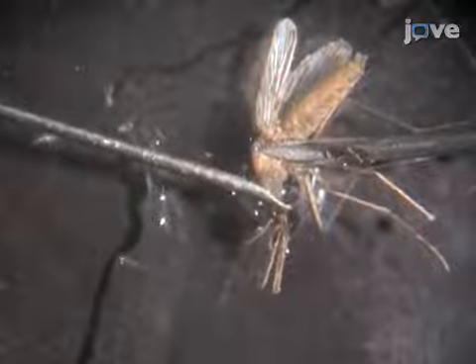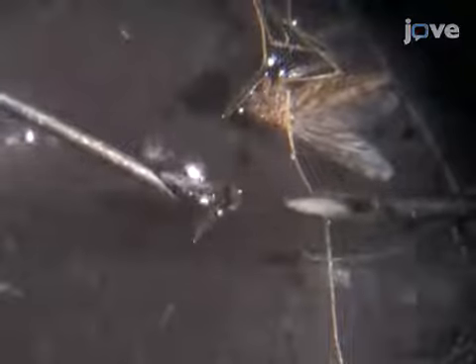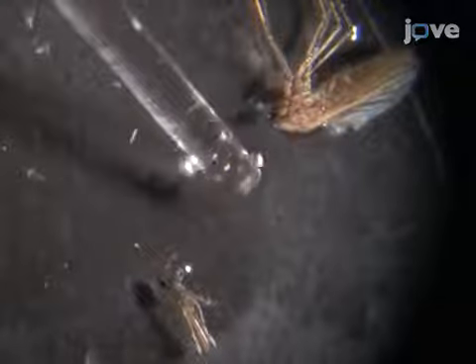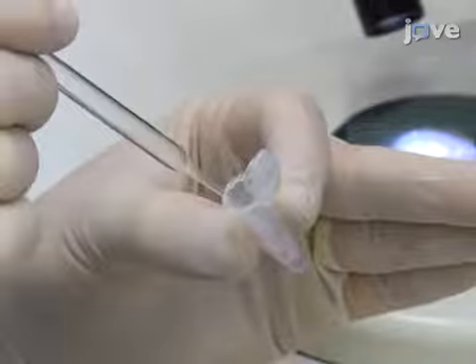Carefully stretch the mosquito between the head and body with forceps and use a syringe and needle to isolate the salivary gland. Next, collect the salivary glands from the glass slide by sucking them up with a glass pipette and transferring them into a 1.5 milliliter centrifuge tube.